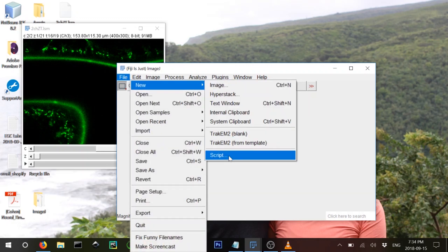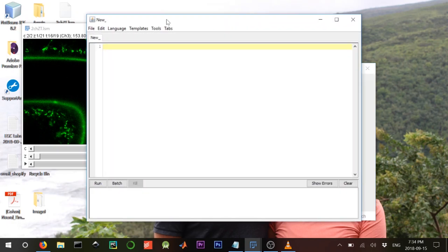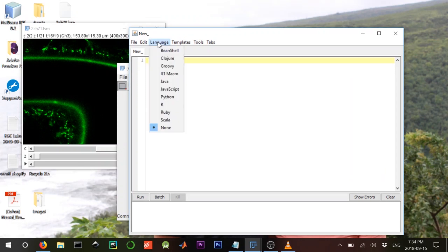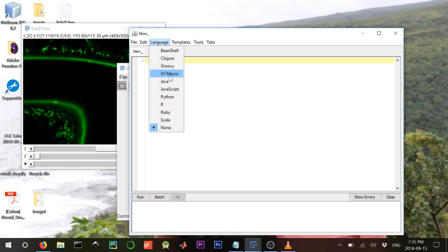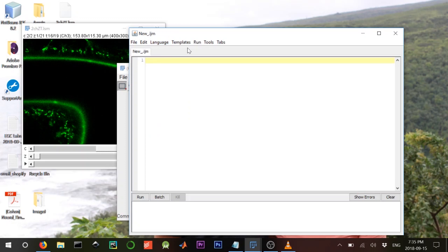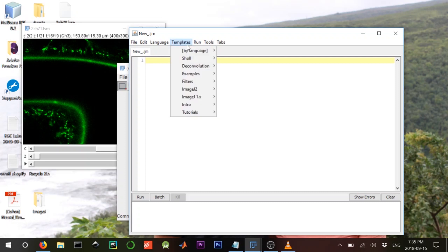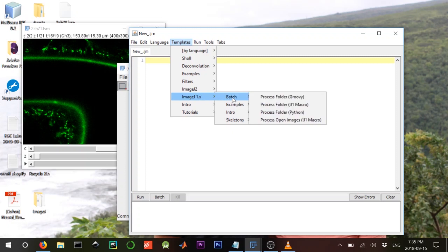First we create a new script: go to New, then Script, and open that. We switch the language to IJ1 Macro. I'd honestly advise doing this in Java since ImageJ is written in Java and it's more powerful, but for now we'll use the macro — it's simpler. For batch processing there's a template, so click Template, go to ImageJ Batch, then Process Folder.